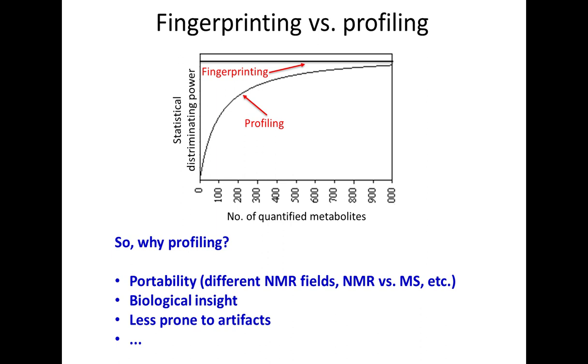Since we seem to be actually rather successful with fingerprinting alone. And there are many reasons. One is portability, because if you do fingerprinting, you're linked to a specific instrument, to a specific, very strict SOPs that we use. Thanks to Bruker, we are, with many other labs, standardizing the way we acquire the spectra, and so on. But this precludes, for instance, comparison with fingerprints taken at different NMR fields, or even with other techniques like mass spec.